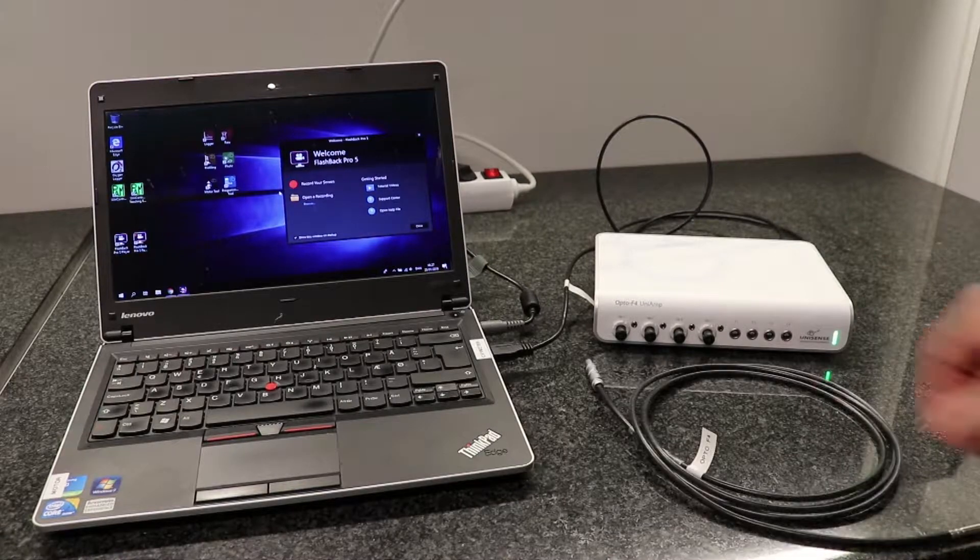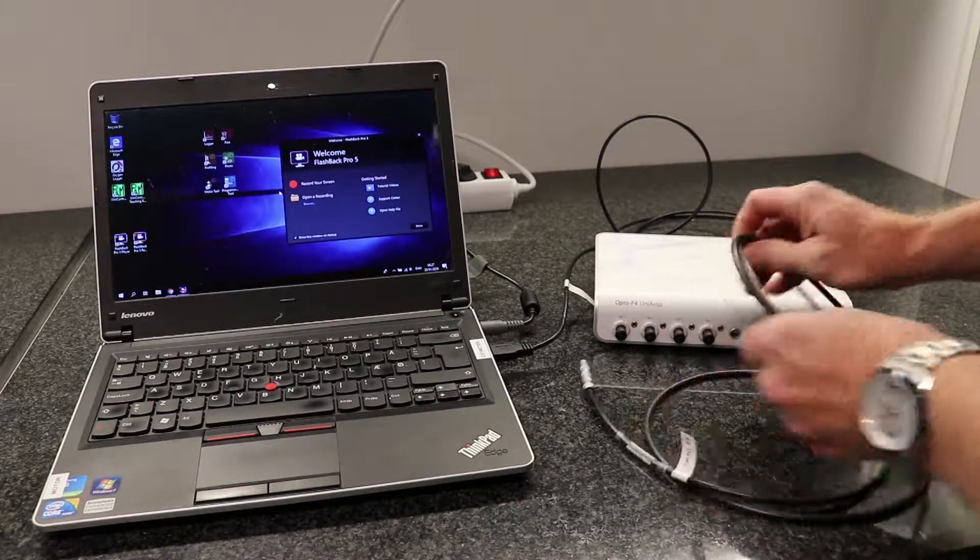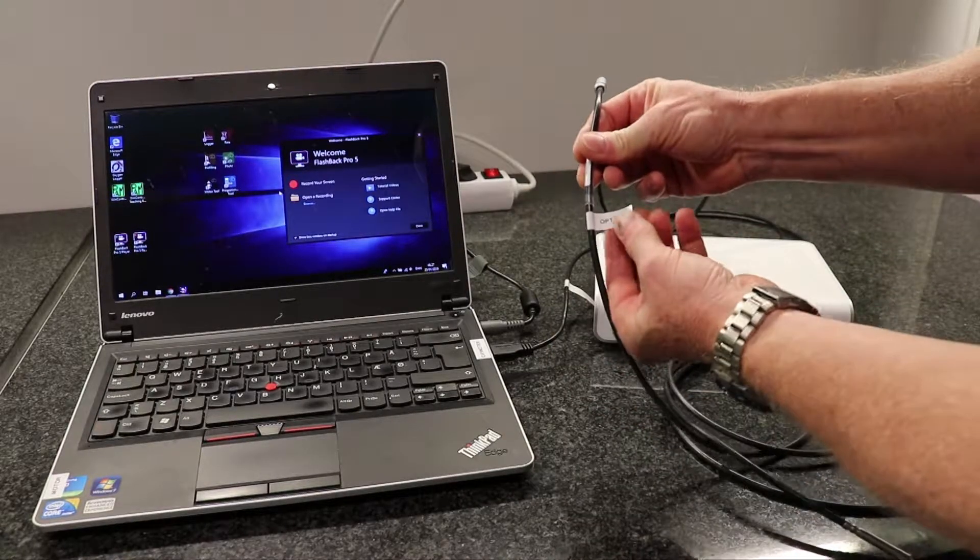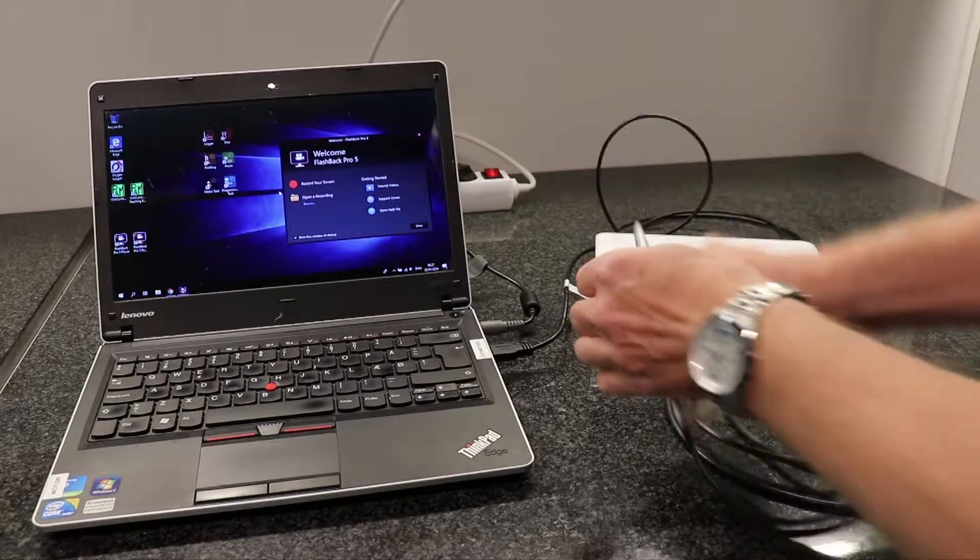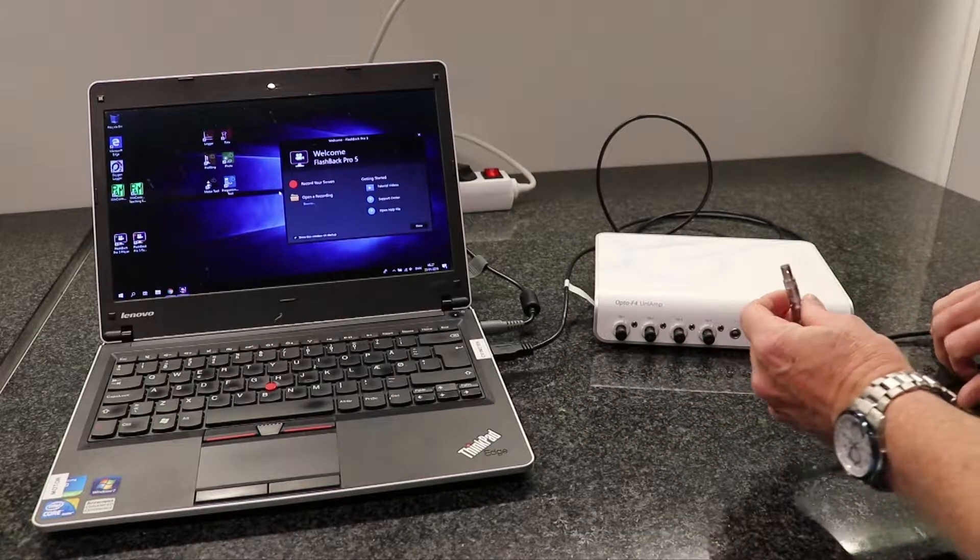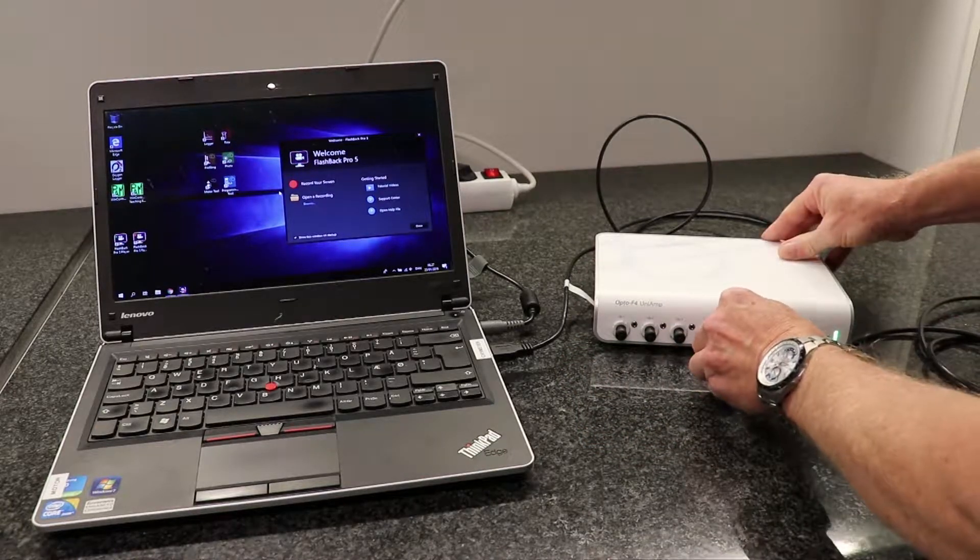Then you connect the temperature cable. Make sure that it's a temperature cable for the Opto 4 meter connected.